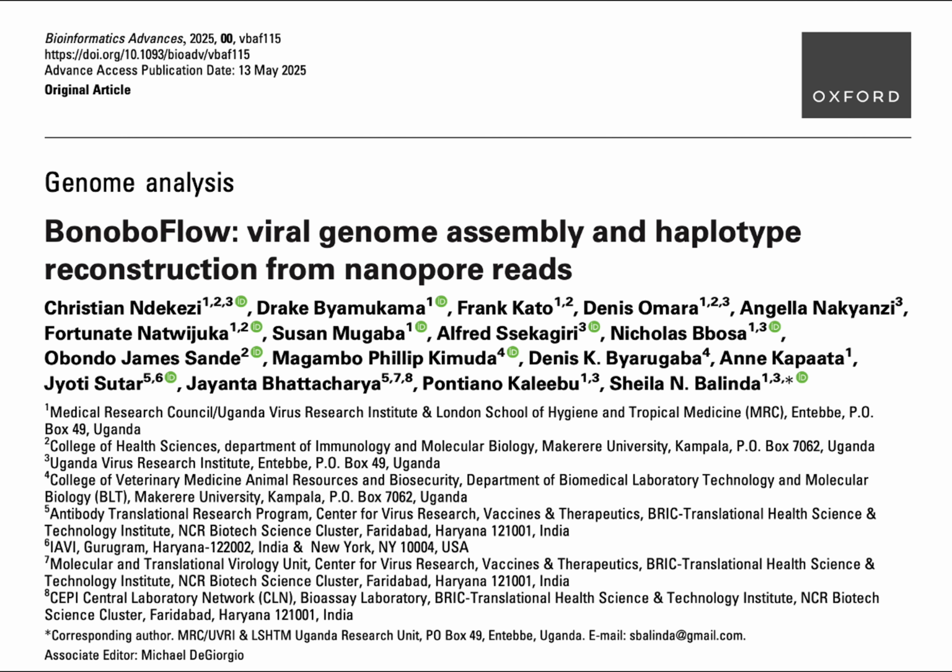Yes. And it just enables more advanced viral characterization overall, performing multiple sequence alignments, accurately estimating open reading frames for protein prediction, doing subtyping or genotyping, all become more reliable, leading to a much deeper understanding of viral biology, from a single infection right up to global patterns. It sounds incredibly powerful, that ability to see so much more detail and get it relatively quickly.